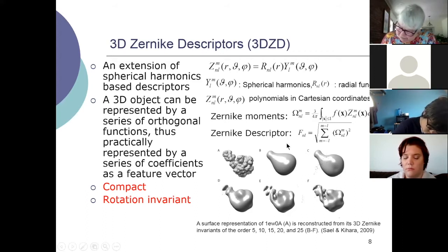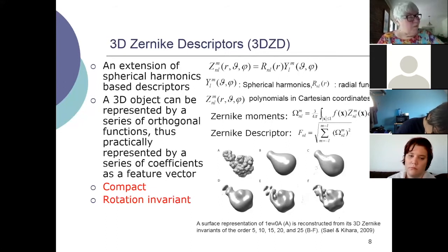Daisuke, this would be just the outside of the protein. Would the shape also incorporate the active site? So if I wanted to search for a small molecule that would fit in my active site, could I do that as well? Yeah, so actually, yes.